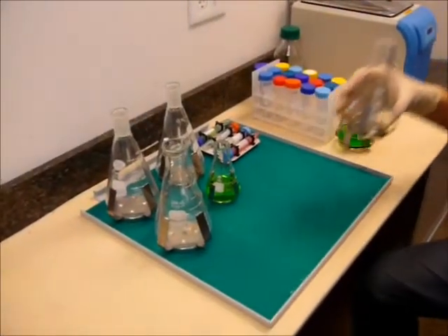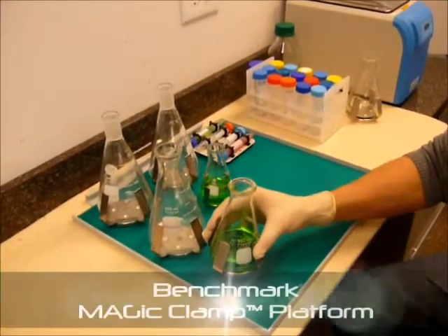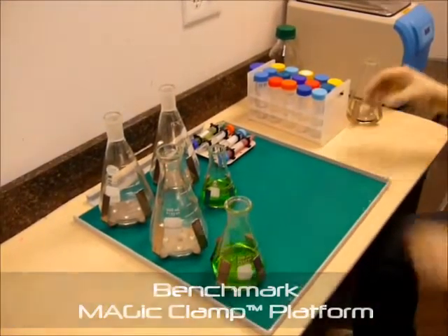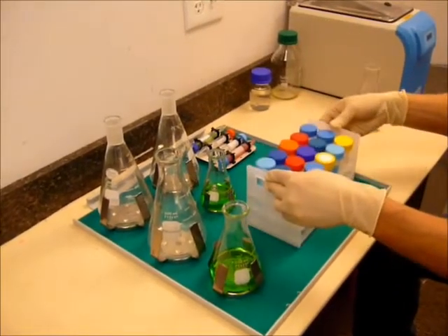With the new Magic Clamp Platform from Benchmark, clamp exchange is simple, instantaneous, and tool-less. Just remove and attach clamps by hand, utilizing the patent-pending magnetic system.